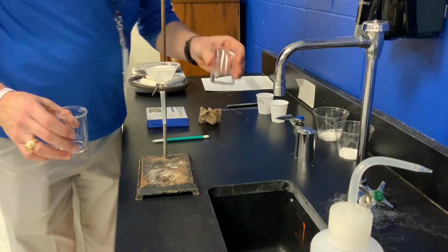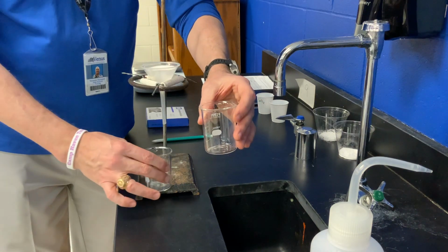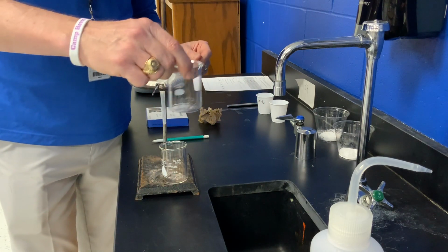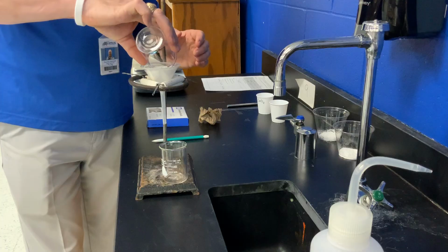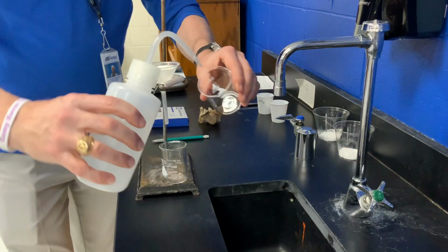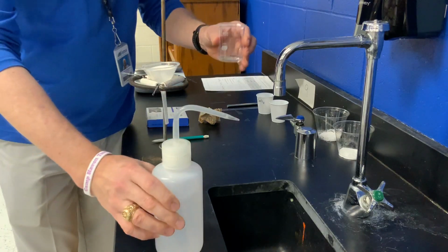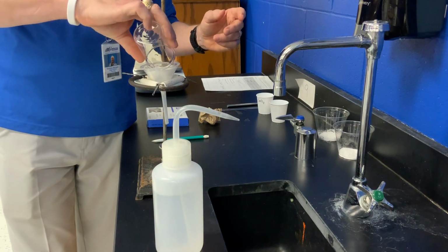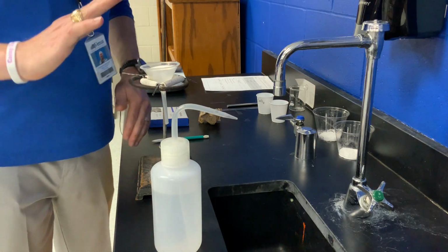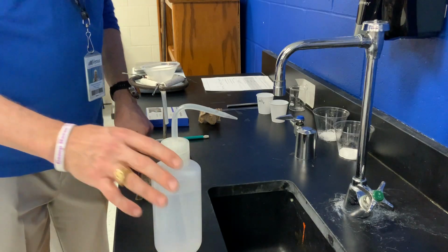You'll have 2 solutions. You'll pour one into the other. Empty beaker goes there. Other beaker, you'll see the white substance. You swirl it. You go into the filter paper. Don't go over the top. If you have some left, small squirts of water, to get rid of it, swirl it into the filter paper. Remember, the more water you use, the longer it takes. So you want to use as little as possible.